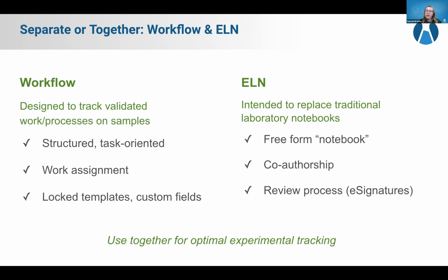Workflow was intended to track very structured, validated work processes on samples. So things like, I want to make a sample request, or I want to ship these samples and track that work, or here is a series of experiments that I need to do on a set of samples. That's what workflow was intended for.